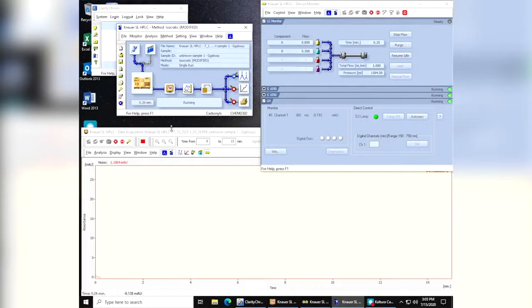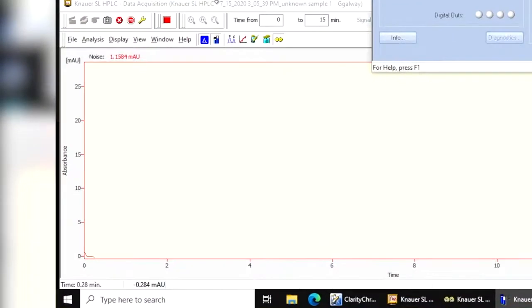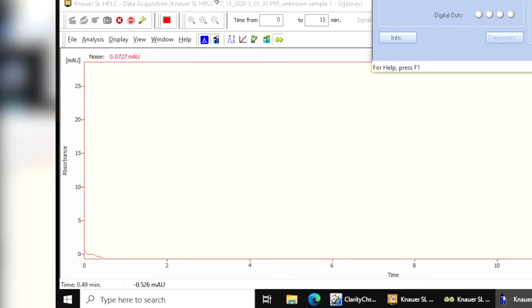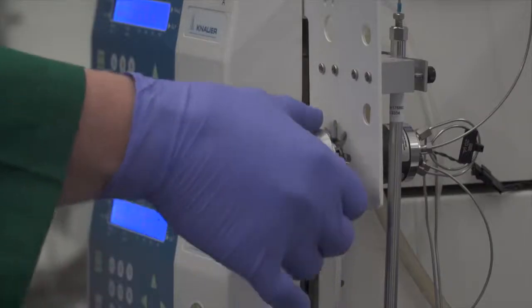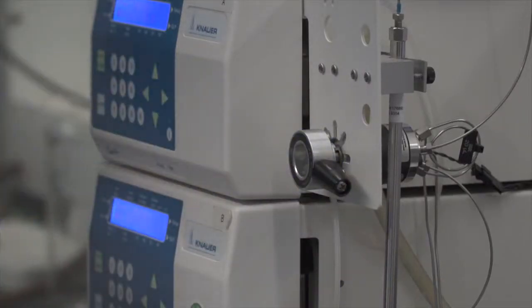This will now run. We can see down here on the screen that a little trace has started to record here. What we're going to do is we're going to wait for this time scale down here to reach about half a minute. And remember that half a minute is in base 10, so it's going to be 0.5 of a minute. Once it reaches 0.5, we can turn the sample loop and take the syringe out.